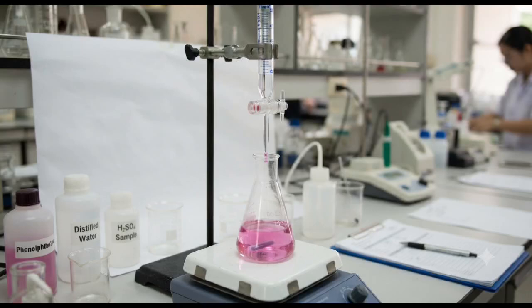Hello everyone. How do pharmaceutical laboratories determine the concentration or assay of a drug accurately? One of the most fundamental techniques is titration. In this video, we will understand the principle, types, procedure, endpoint, calculation and pharmaceutical applications of titration.